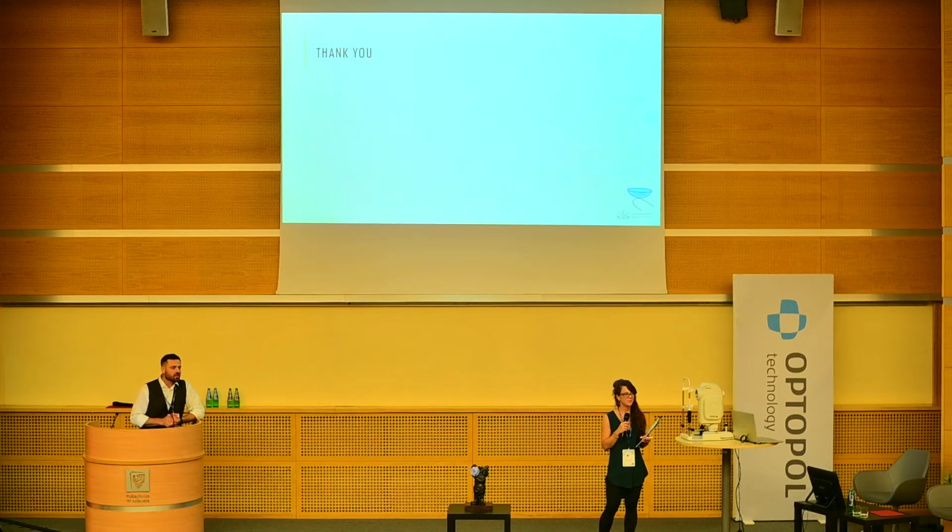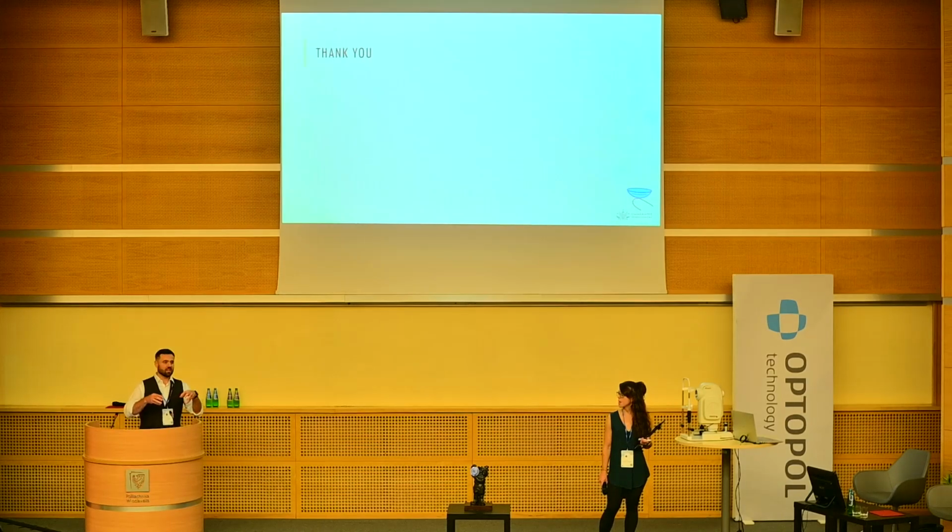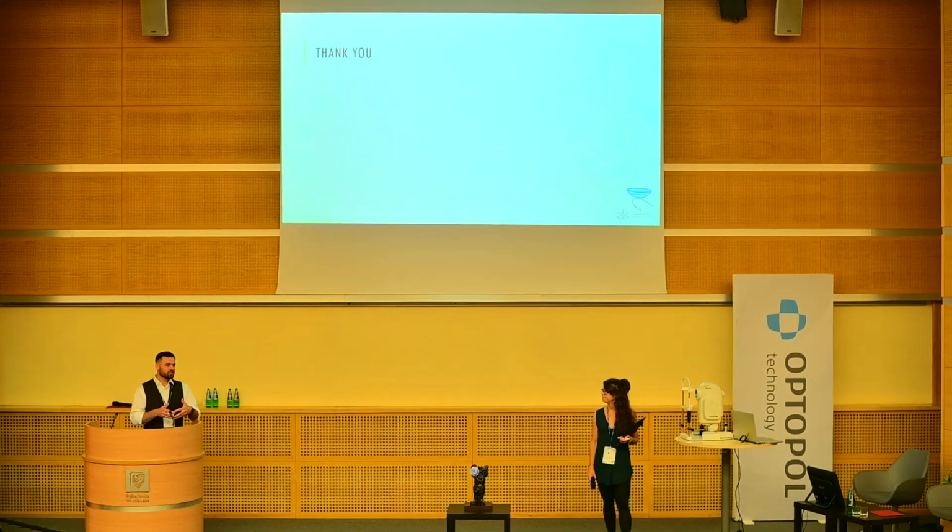Hi. I wonder, why did you choose this particular imaging method? I know you went for fluorescence, but why this type? Why confocal microscopy? Yes, for the resolution, for seeing the microstructures to understand them better. I think this kind of microscopy can give us very high resolution images in small samples. What about two-photon fluorescence? Actually, I didn't think about it, to be honest. I think it's got a better resolution, but I was just wondering. Okay, thank you for your feedback.